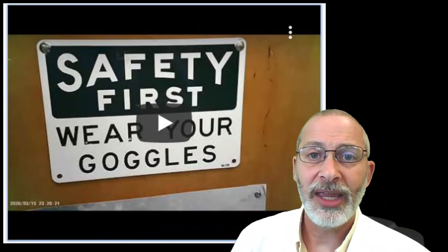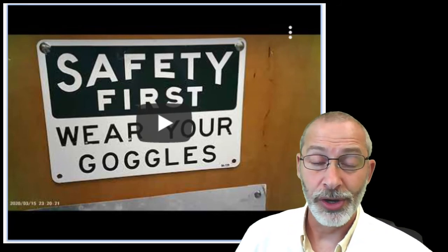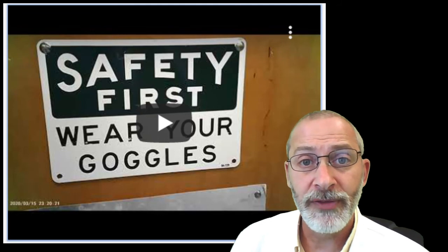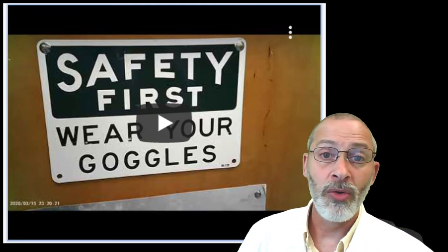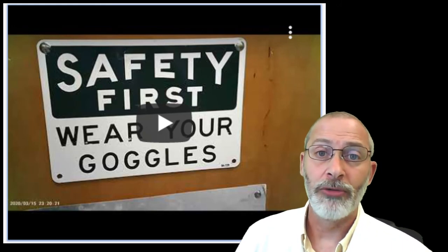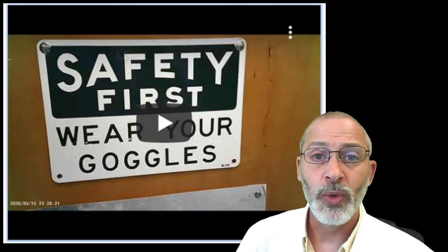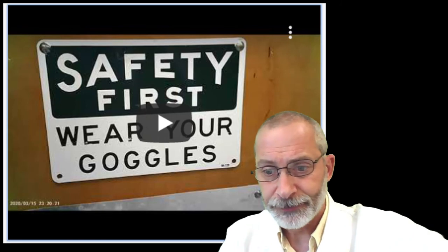They are dedicated to you and only you throughout the year. And I will explain to you the distribution of those goggles and how you should keep them neat in your own individually labeled slot. And you are responsible for the care of your goggles and your apron as well, which is also in the same shelf as your goggles.